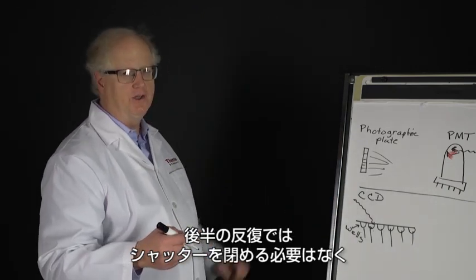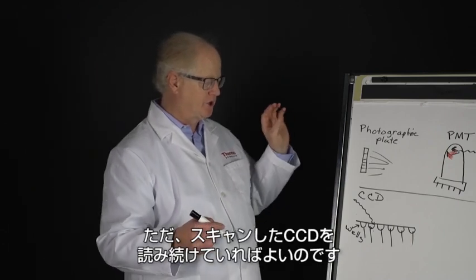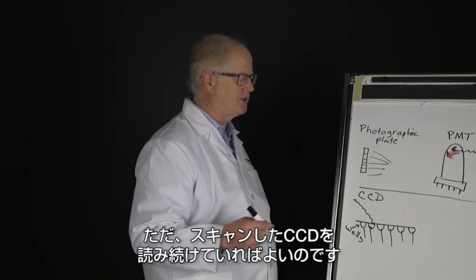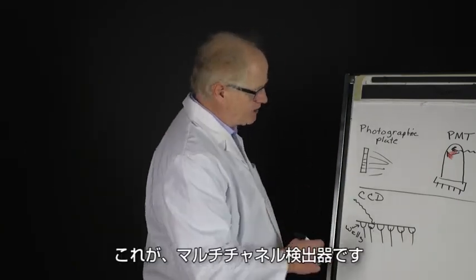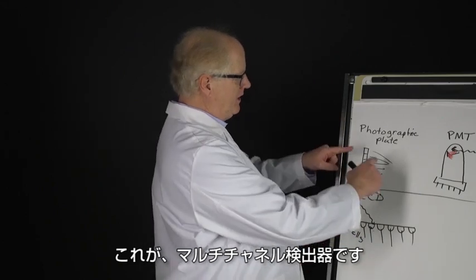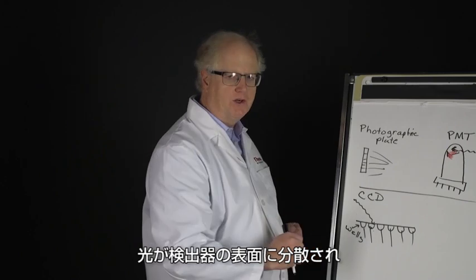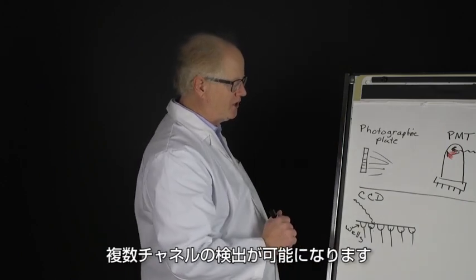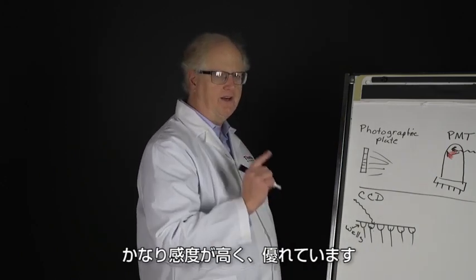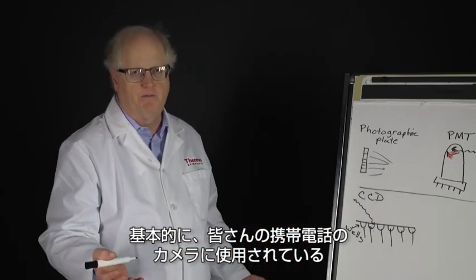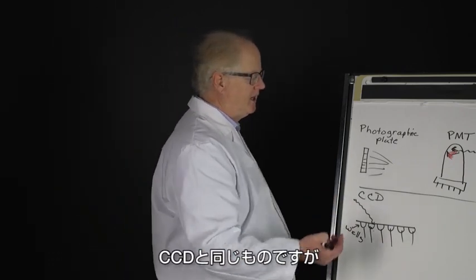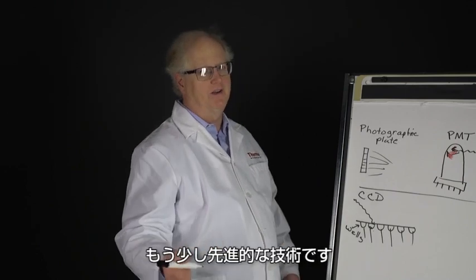In later iterations, you would just keep reading the CCD as you scan. So this is a multi-channel detector similar to the photographic plate. The light would spread out over the surface of the detector, give you multi-channel detection - quite sensitive, quite good. It's basically the same thing that's in your cell phone camera, but obviously a little more advanced, a little more sophisticated electronics behind it.